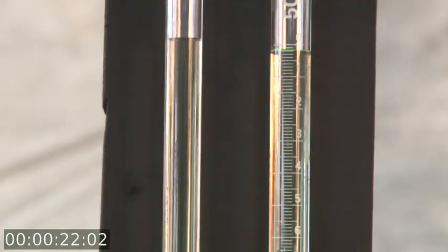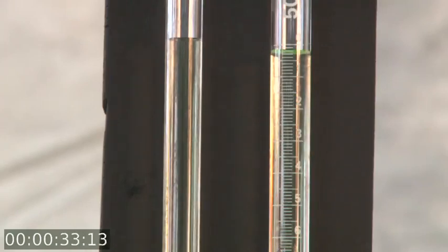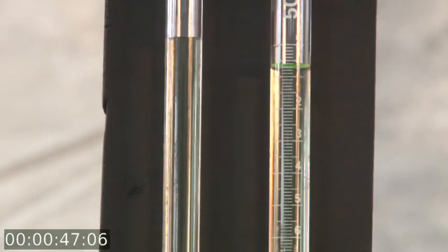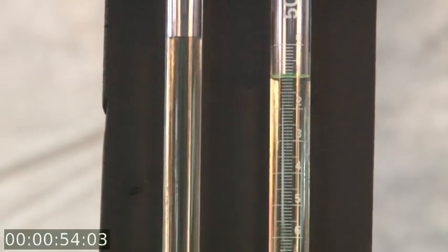We're down to 0.2 cm³ evolved, and the reaction is going to proceed as the liquid comes down in the right hand arm of the gas burette. You can see it going up in the left hand arm of the burette. So we're now down to about 0.6, 0.7 cm³. It continues to come down. We're at 0.8, 0.9, 1 cm³ has now been evolved.